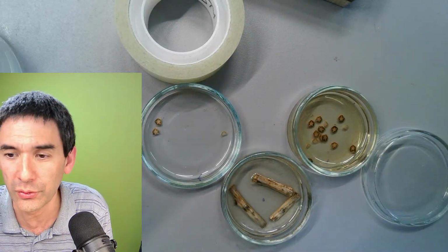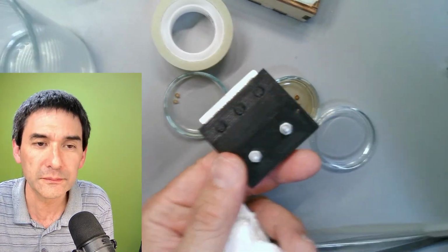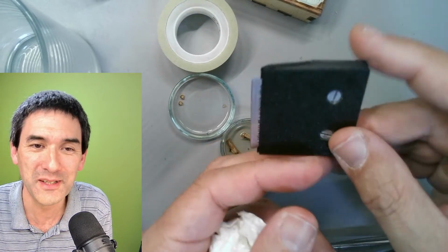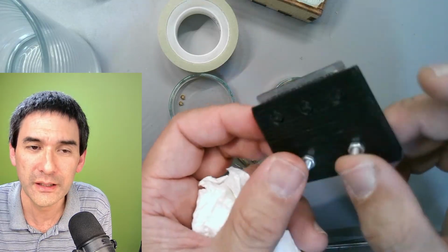And I want to show you what I've done here. So this is my homemade microtome knife. It's 3D printed, as you can see. 2 screws in here. I put them a little bit deeper so that they do not scratch, right? And this is a regular razor blade.